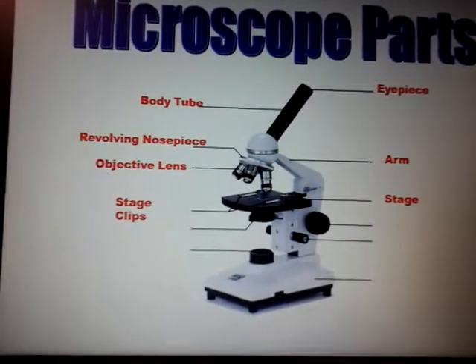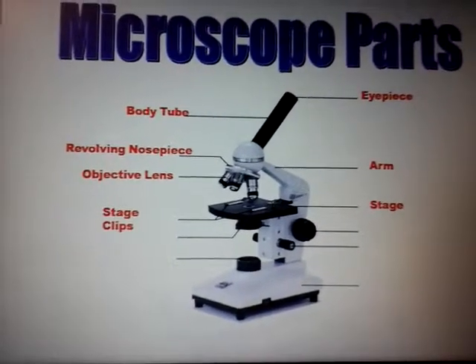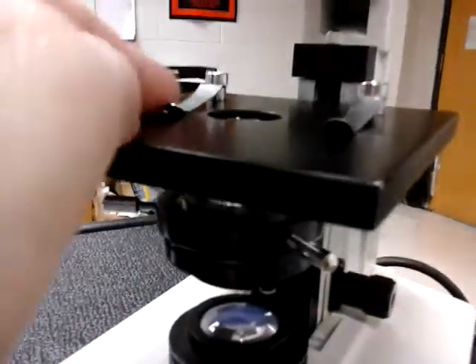You then have these things called the stage clips. Now, they drew the stage clips on your picture, but it wasn't labeled. But these are your stage clips here, and the stage clips are used to hold your slides in place.